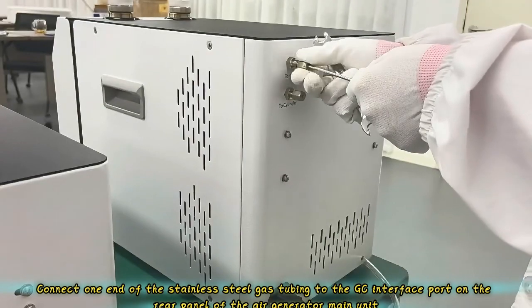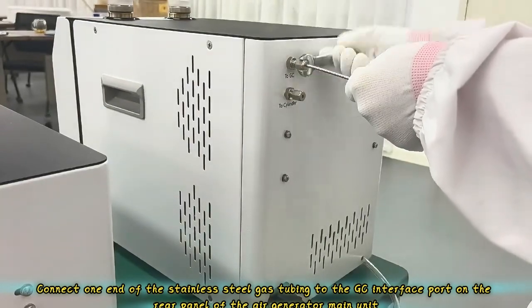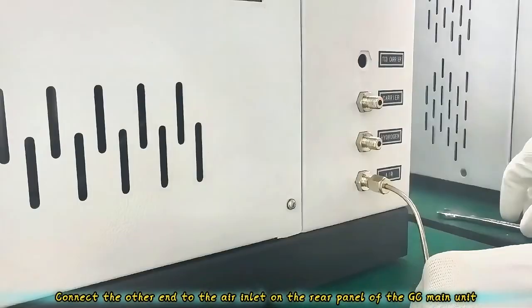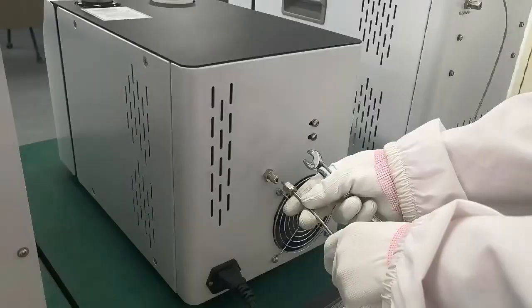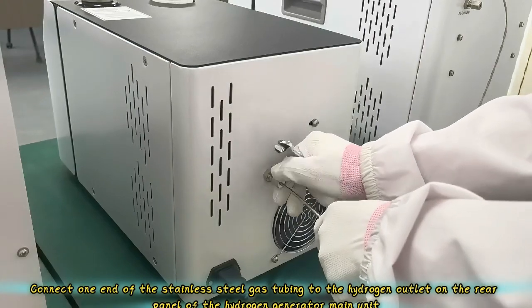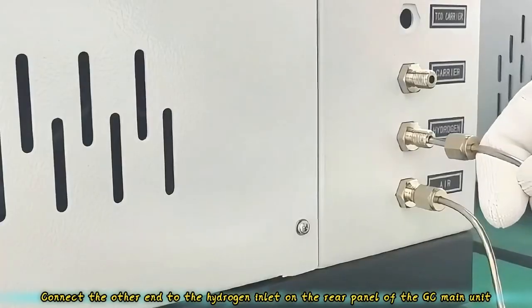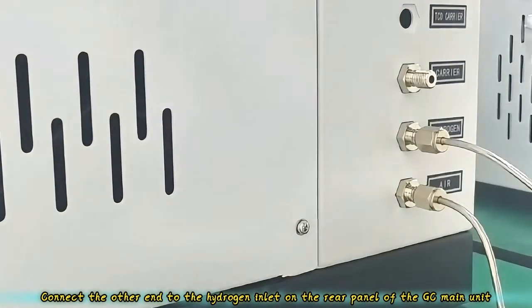Connect one end of the stainless steel gas tubing to the GC interface port on the rear panel of the air generator main unit. Connect the other end to the air inlet on the rear panel of the GC main unit. Connect one end of the stainless steel gas tubing to the hydrogen outlet on the rear panel of the hydrogen generator main unit. Connect the other end to the hydrogen inlet on the rear panel of the GC main unit.